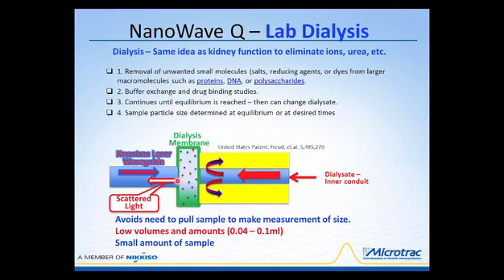And then the scattered light is produced due to the interaction of these particles with the main laser, and that's carried back to a detector system, which develops those signals that we use for the loading index calculation and linearity. But at this point, we're using it to carry information on the size of the proteins. Now, during this time we have this dialysis bag, and what we really want to do is provide it with some type of dialysate. Again, this dialysate could be water to remove ions, or it could be to promote ionic changes, or even increases, within the dialysis system itself.